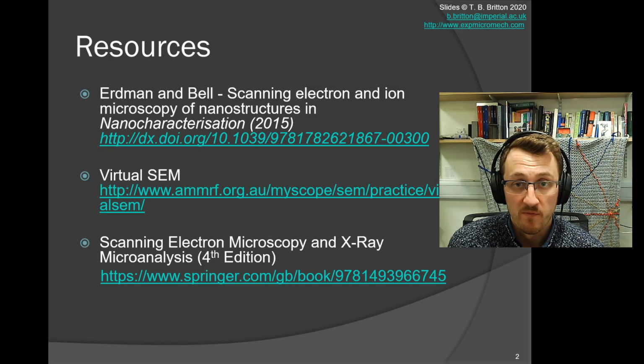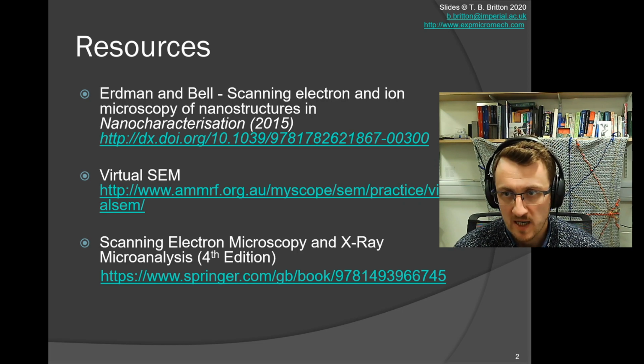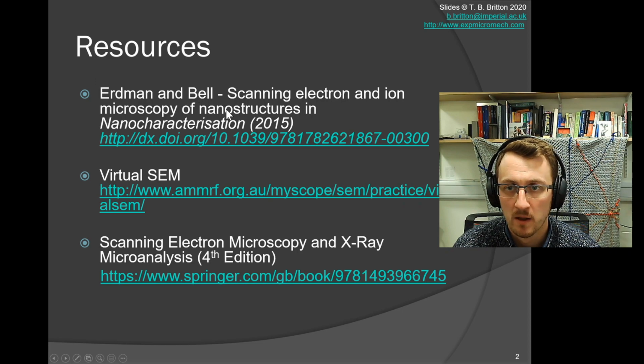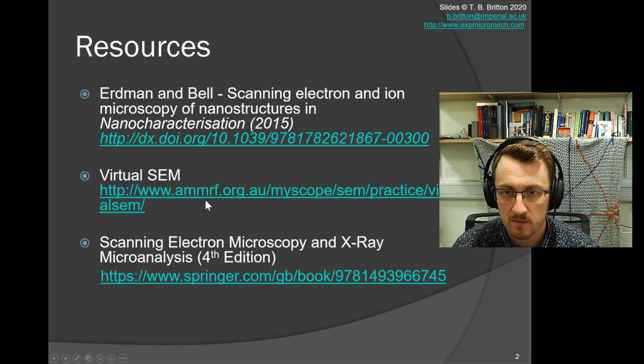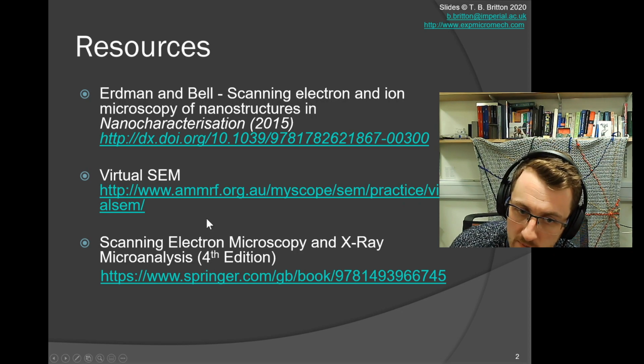First off, there are some great resources. This lecture is a very short taster that will give you some of the underlying ideas, principles, and opportunities available with electron microscopy, scanning electron microscopy in particular. I'd strongly suggest that you have a look at Goldstein, Scanning Electron Microscopy and X-ray Microanalysis, and Erdmann and Bell, scanning electron and ion microscopy. There are also great online resources to teach you about microscopy using virtual tools, such as the virtual SEM from the Australian microscopy community.